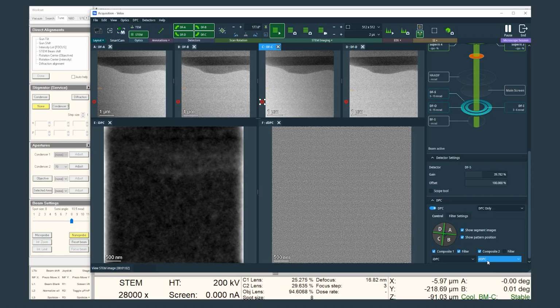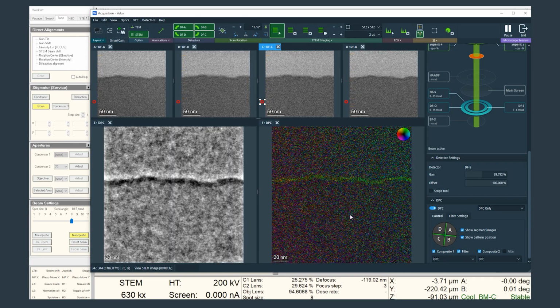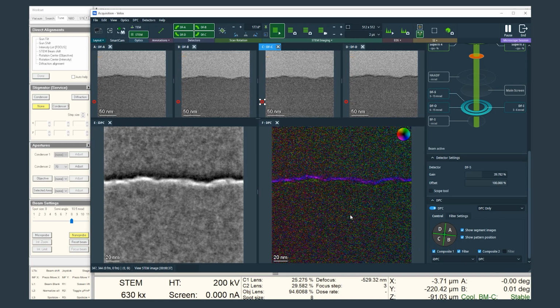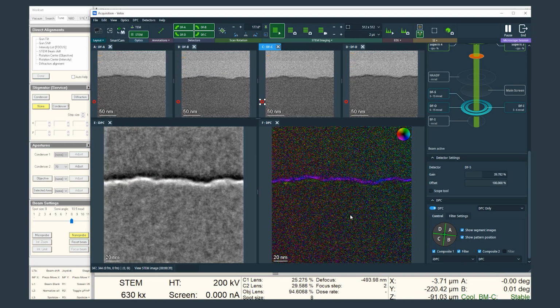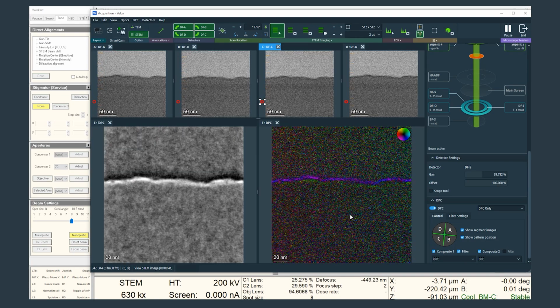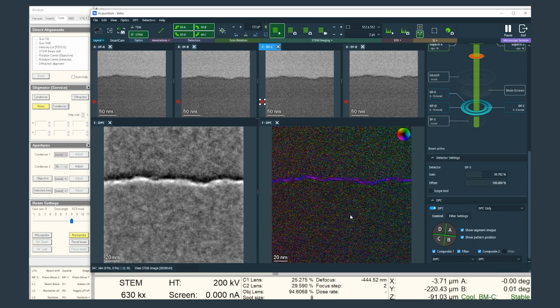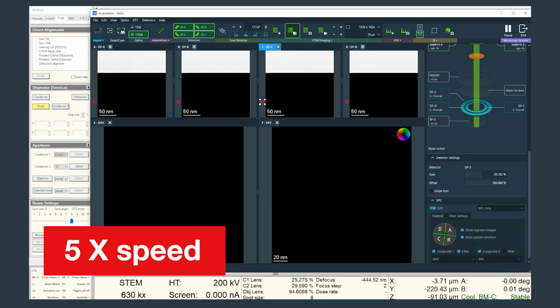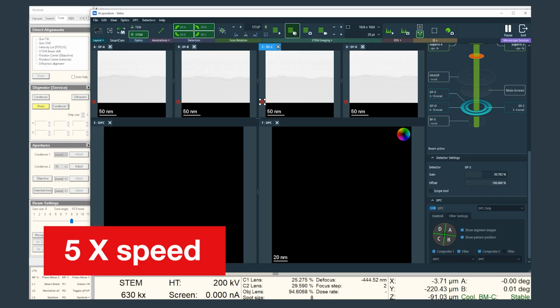We select our iDPC condition, which measures the offset between segments to show light elements and electric potential with our patented live imaging technology. The barrier region of interest is centered and focused for analysis. Finally, the acquisition conditions are set and the frame captured.